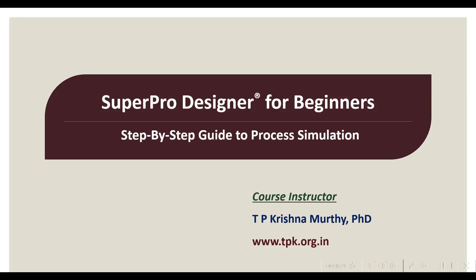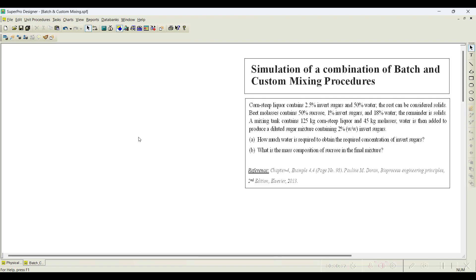Namaste. Welcome back to the tutorial series on SuperPro Designer for Beginners. In this tutorial, let us see how to simulate the combination of equipment — a batch mixer and a custom mixer. Let us explore the characteristics of the custom mixer option available in SuperPro Designer.